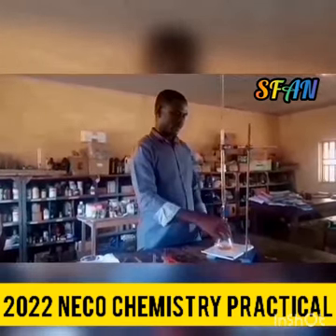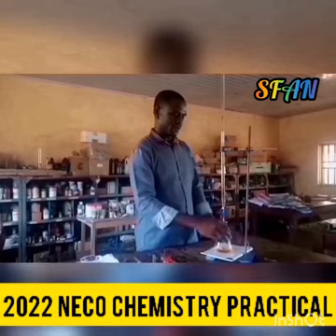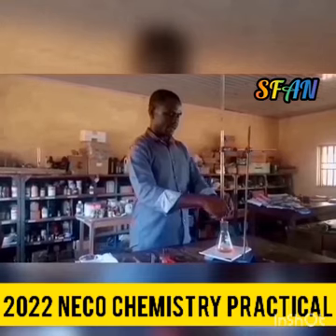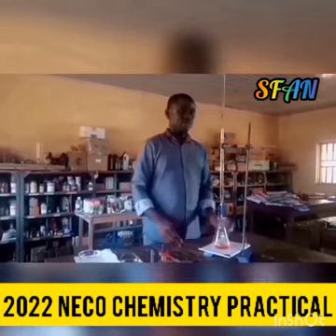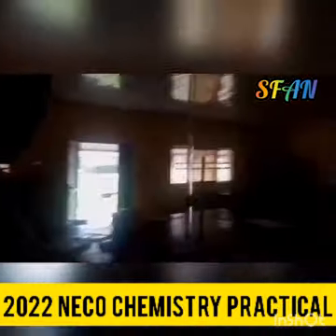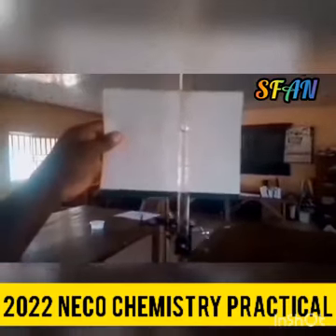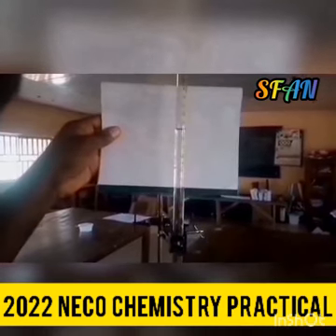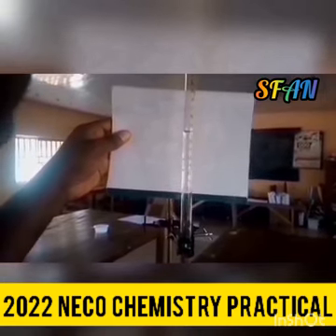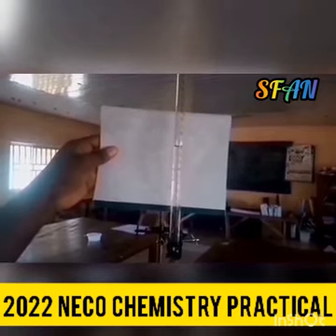I add the acid in a dropwise manner, and that is the endpoint. So bring the camera closer. And from what I have here, I have about 13.6 as my endpoint.